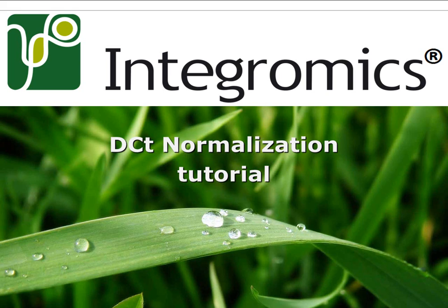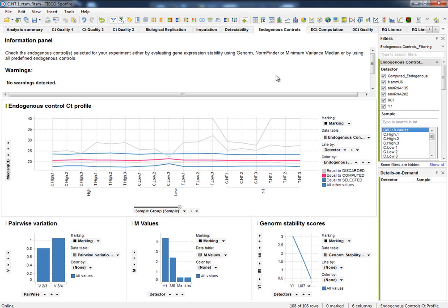This tutorial focuses on an important quality step prior to the classification and differential expression of the analysis. The delta-CT normalization standardizes the differences in nucleic starting material in our samples, something that is essential for comparing our biological groups. To do that, we normalize our data using a set of endogenous controls that maintain their expression levels despite different experimental conditions. These are the reports we get after a click-and-go execution, and they allow us to check how healthy our controls are and whether the normalization might modify our data.